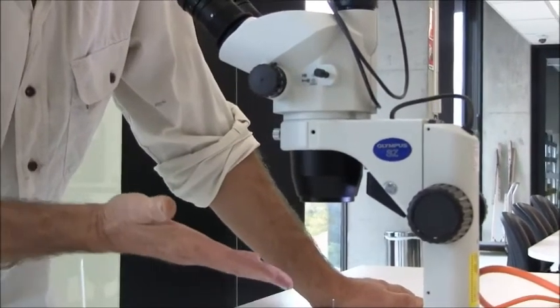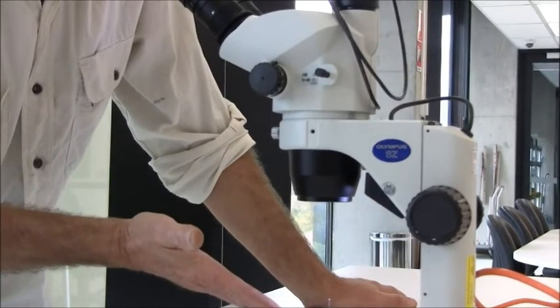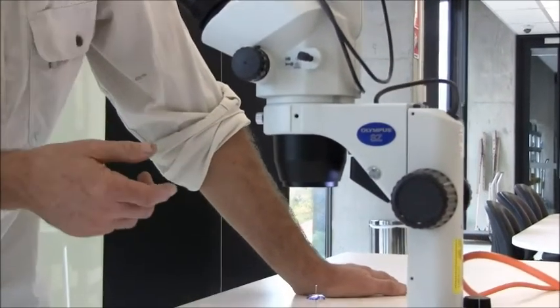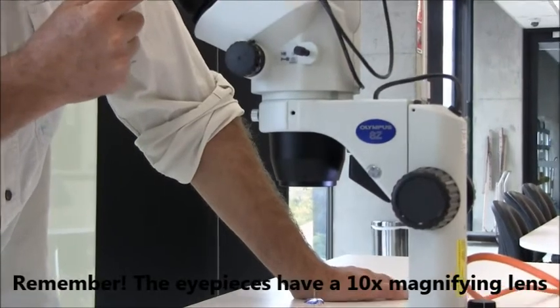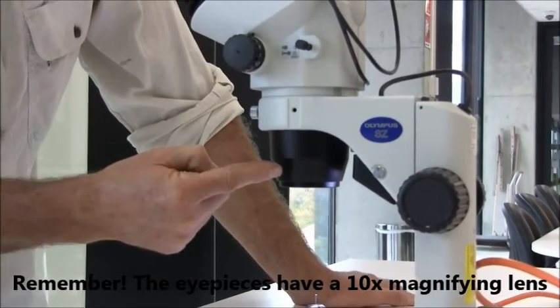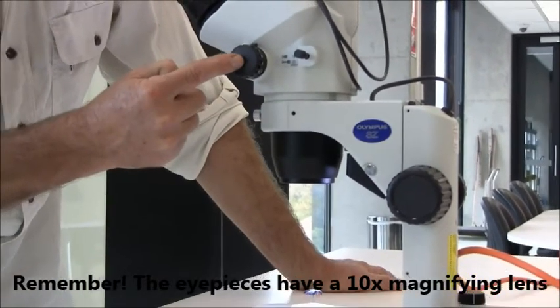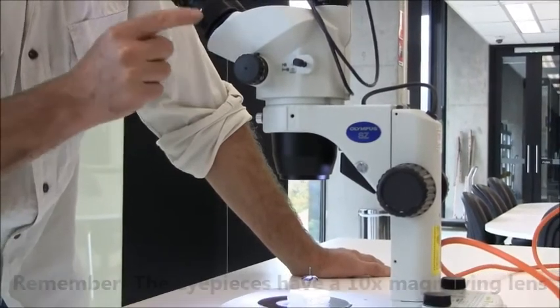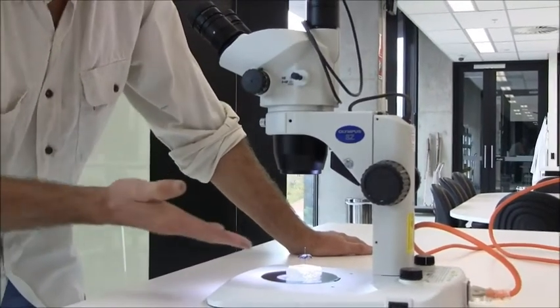Now what we're currently magnifying this specimen at 6.7, because the eyepiece is times 10, and because the objective lens, controlled by this knob, is 0.67, 10 times 0.67 is 6.7.